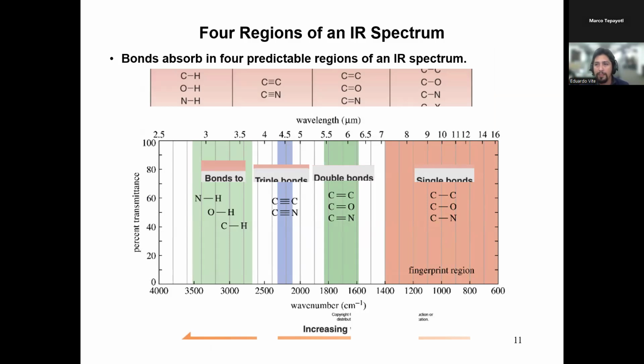Think about it. Organic molecules inherently by definition are mostly carbon, right? So you're going to have a whole bunch of carbon-carbon vibrations throughout the whole molecule. That doesn't really tell us much. We know it's an organic molecule. We'll most likely know what the molecule is, like how many carbons are present. So the fingerprint region is kind of just there to look at. If we really have nothing else to go off of, it's a good place to take a look, but it is not the first place we look. The fingerprint region is more like, well, that's some noise. It still gives us important info, but we usually don't take too much of a look at it.